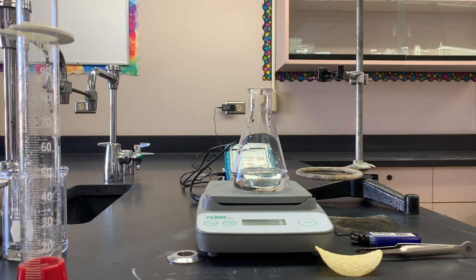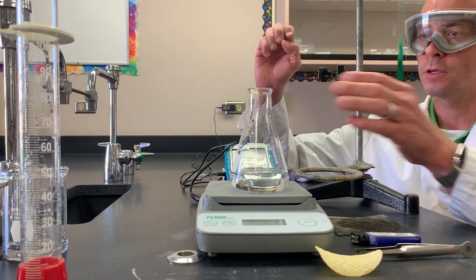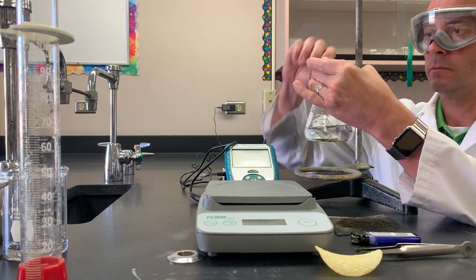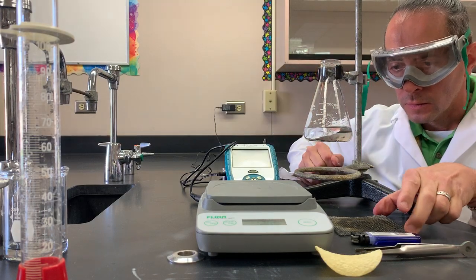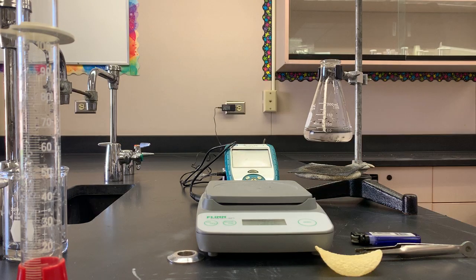Our next step is getting our ring stand set up together. We have the iron ring already securely on the base of the ring stand. The clamp is securely in place as well, so it's just a matter of getting the flask into the arms of the clamp and then tightening it up. Our setup is there. We've got about two to three inches or so in between the top of the mesh and the bottom of the flask.